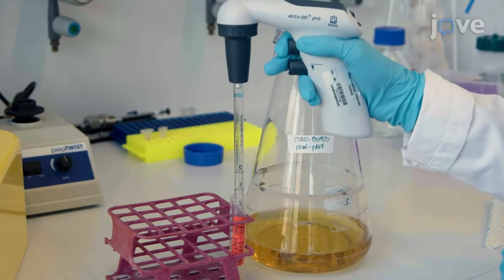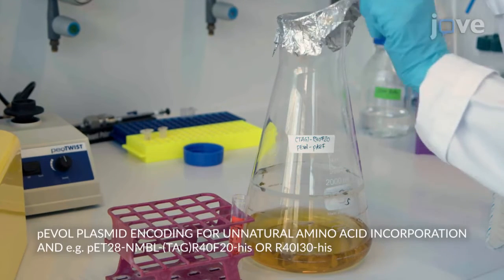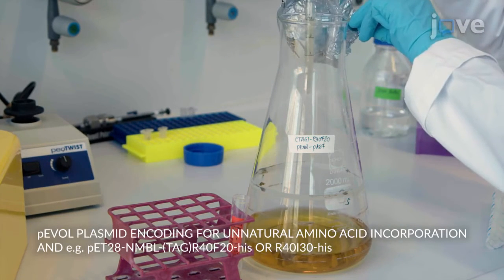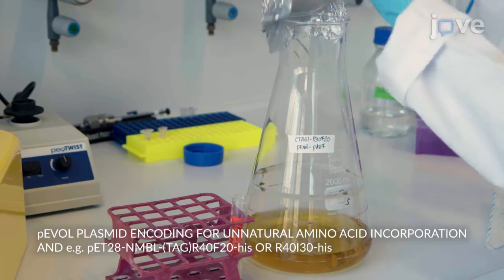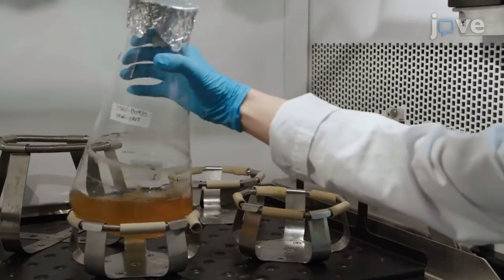For expression of amphiphilic ELP with the unnatural amino acid, inoculate the main expression culture from overnight E. coli preculture containing the appropriate plasmids to an OD of 0.3. Incubate it in 400 milliliters of sterile LB medium supplemented with kanamycin and chloramphenicol at 37 degrees Celsius and 200 rpm.